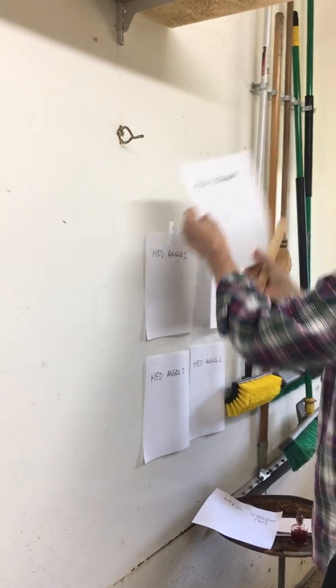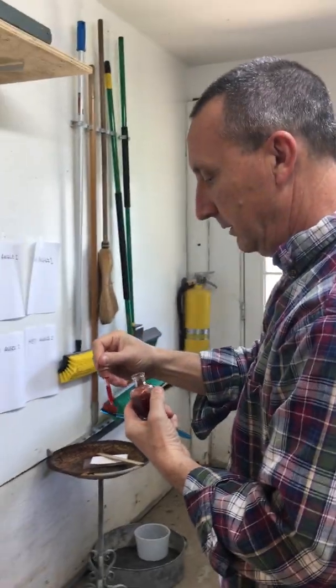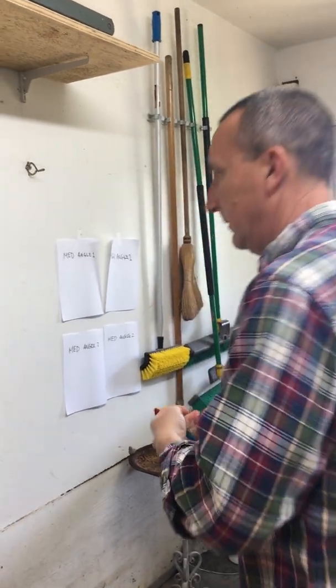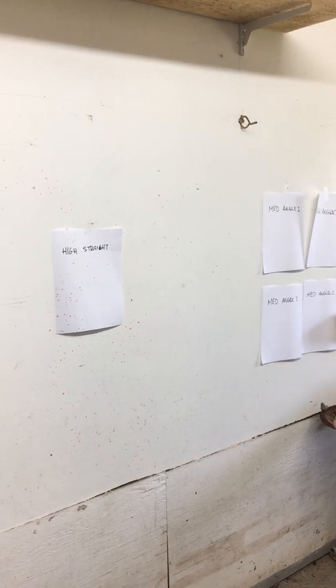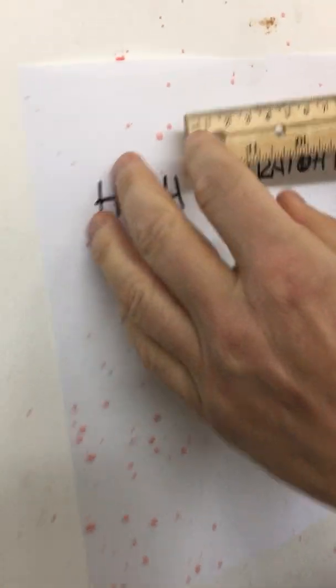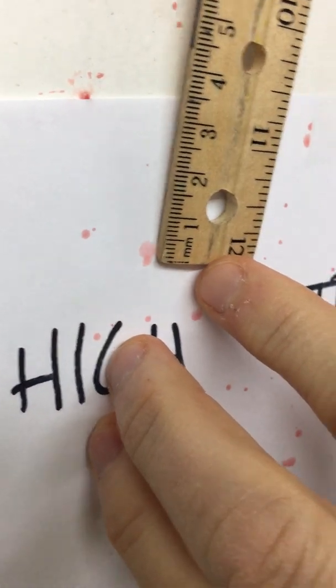Okay, we'll place this paper and do the high velocity spatter. So for a high velocity spatter, I'm going to use a toothbrush to spatter the blood here, or supposed blood here. Right? All right. Okay. Pick 3 dots here, 3 spots. How about this one? 1, width and length.